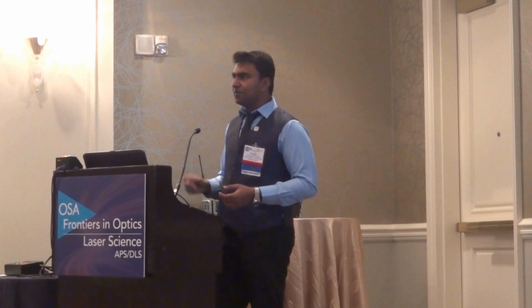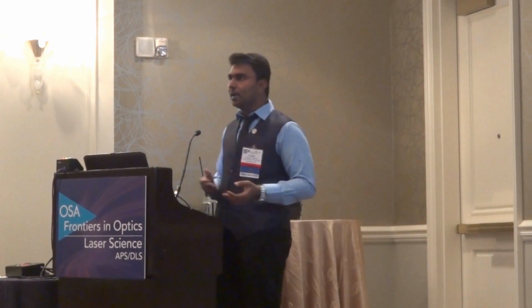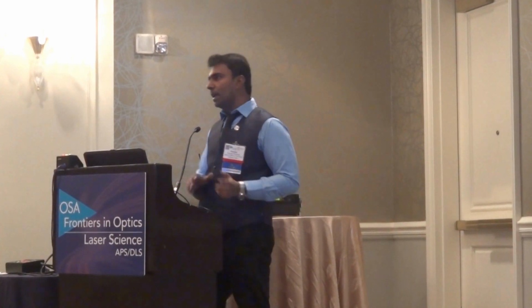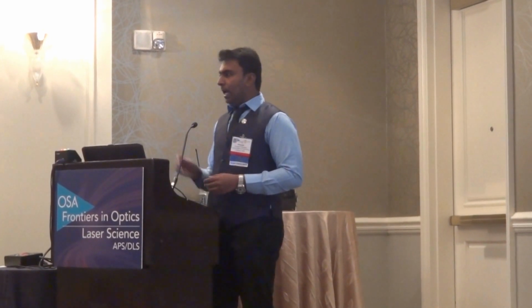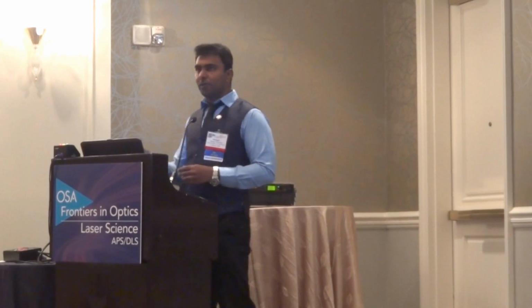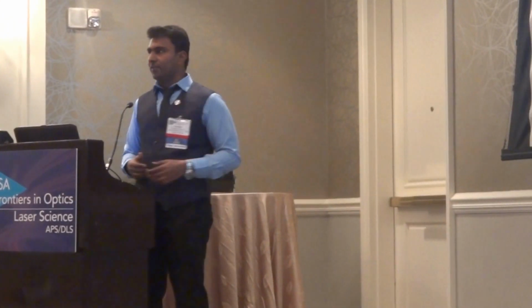The main advantage of going to digital holography is that there is no wet chemical processing. Conventional holography needs more stability. But in digital holography, I can almost do it in real time. And there are different types of geometry, like inline, off-axis, Fourier, fractional Fourier. But we stick to inline holography.